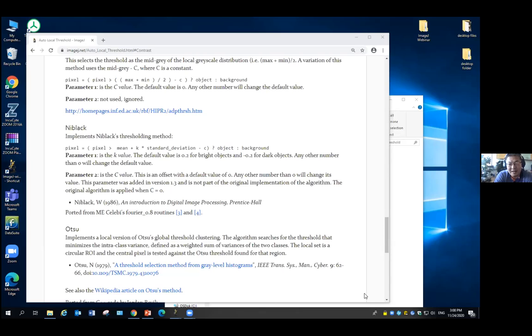If you learn how to write the macro language, that will be much easier. But if not, and you have to manually do them one by one, just make sure you write down all your imaging protocol steps. Make sure all the images that come in are treated the same. Only under this condition can we trust the result and confidently compare it with another result. I always think that is the more important thing.